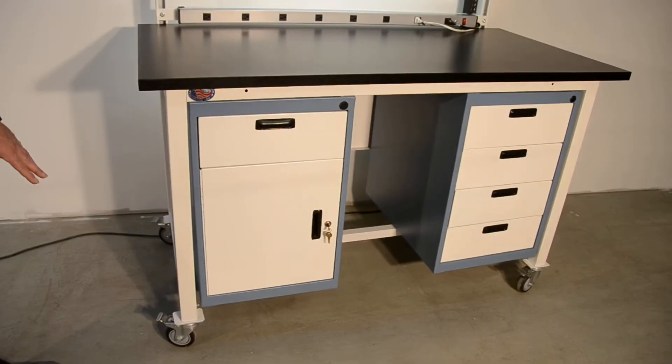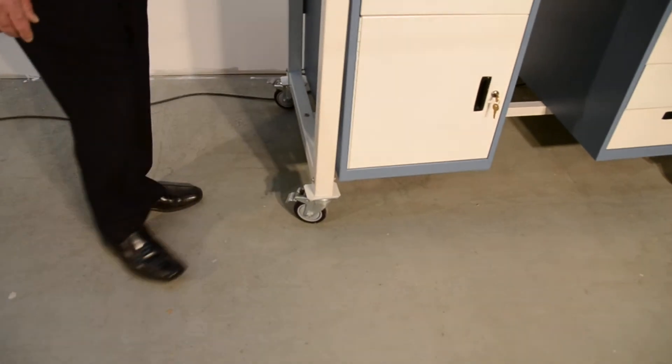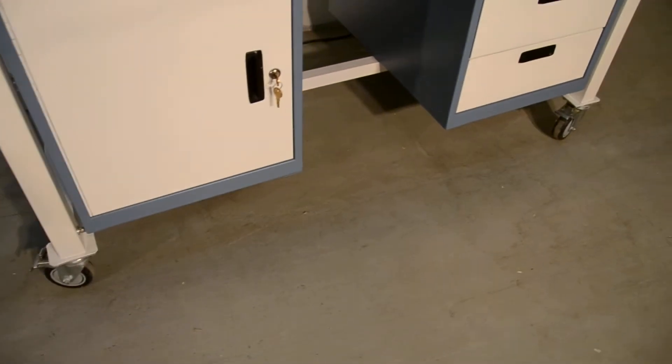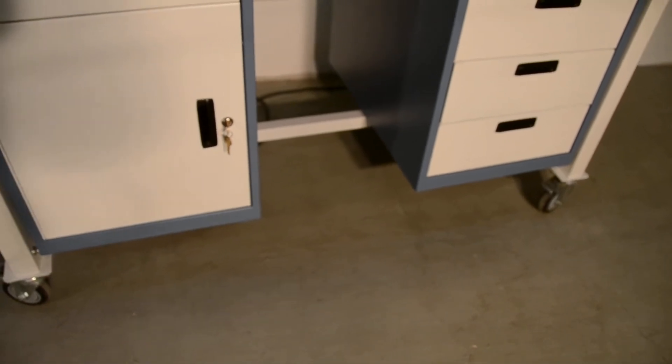We also have our total lock casters, which are nice because they lock not only the roll of the caster, but they also lock the swivel of the caster. We have a footrest which ties the legs together, which is important, something that you want to do when you have a unit on casters in case you're moving over uneven floors with cracks in them or bumps in them.